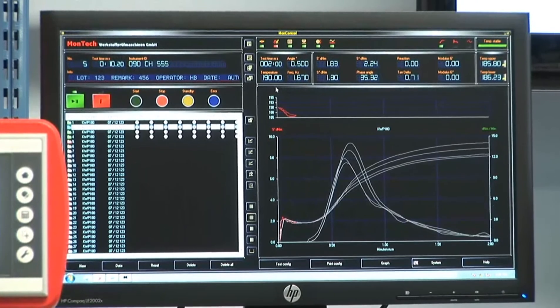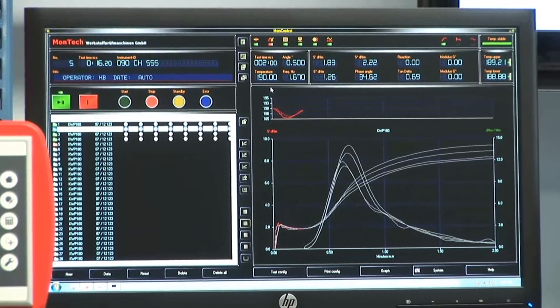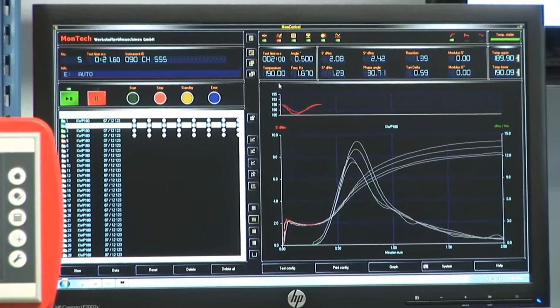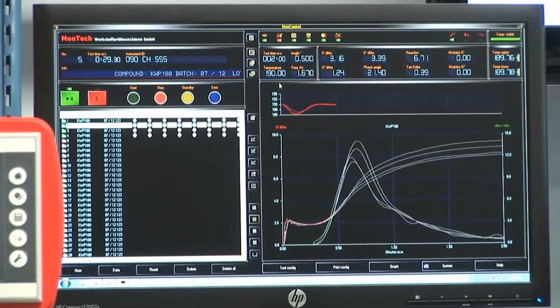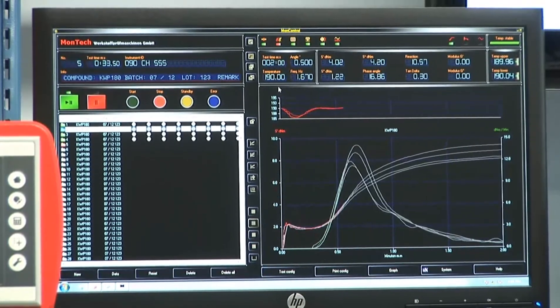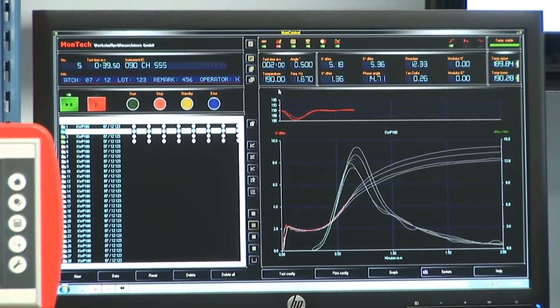On the upper right side you see the current readings, and on the lower right side you see the actual graph of the torque as well as curing speed recorded from the sample currently being tested. On the left we have a so-called test queue, which means you can store a series of tests and only need to place the sample on the tray without the need to identify the samples further in the software.